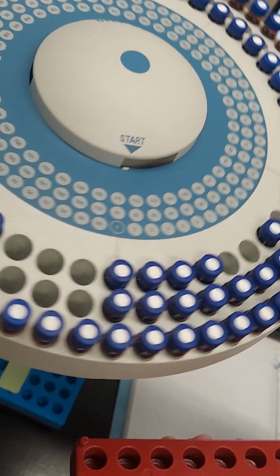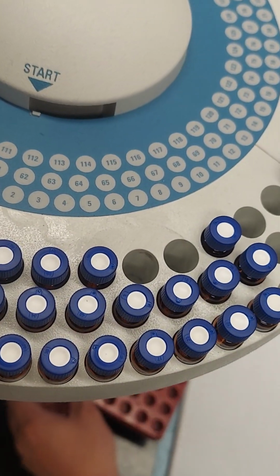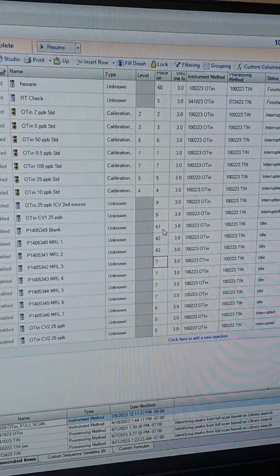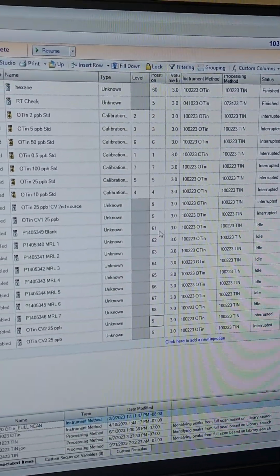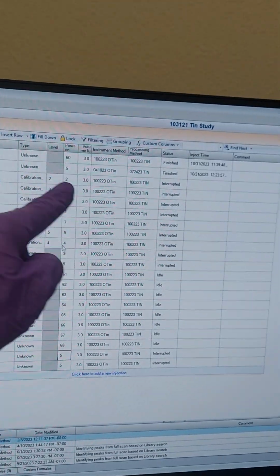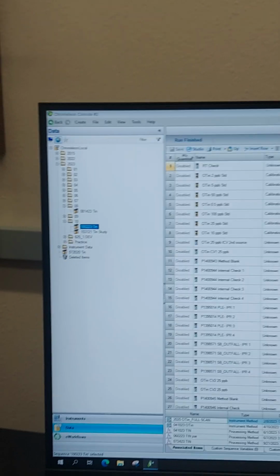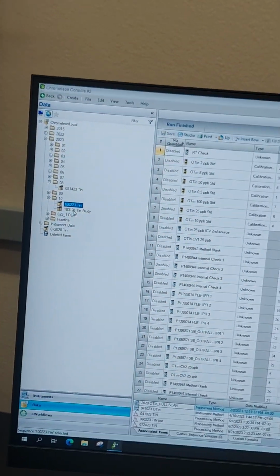Okay. So 61 through 68. 61 to 68. Okay. 61, 68. And then this one is already in position. Yes, you already put it in that position because I copied that from this one. And it's the same. You don't move any. Yeah, I didn't move anything.